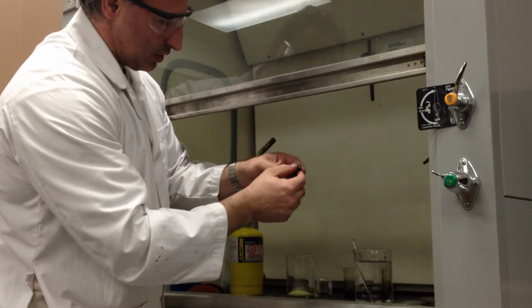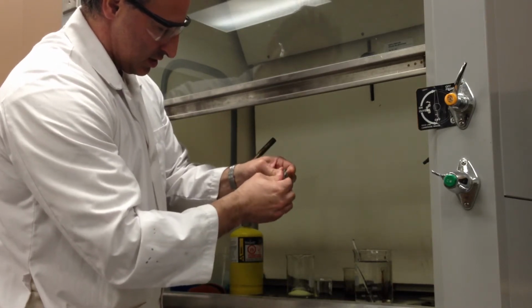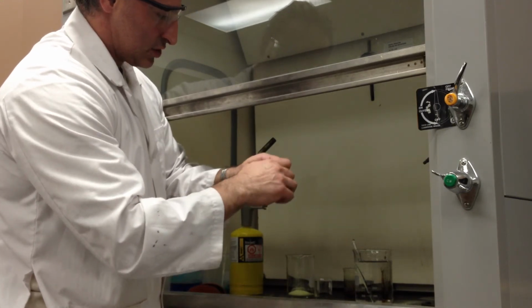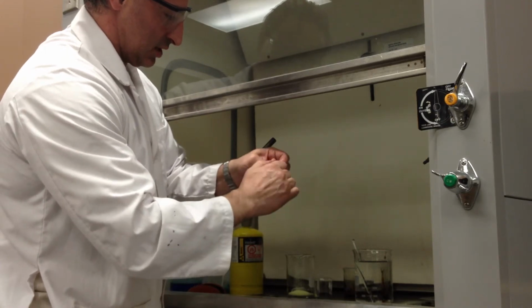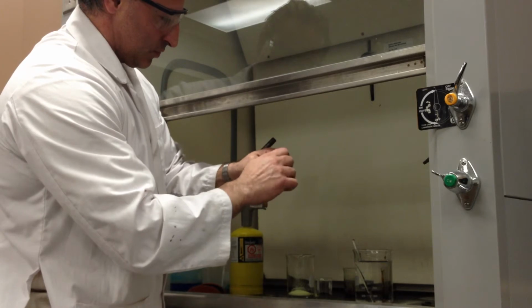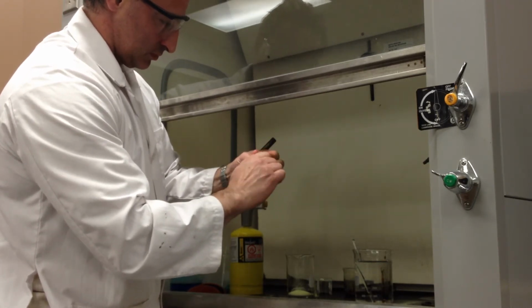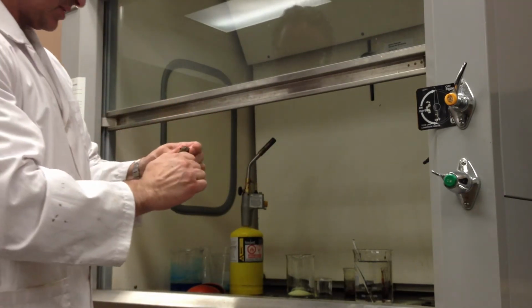And then within several hours it'll return to its harder state. Sometimes minutes. But the reaction can be catalyzed. I don't know what you would have to add to make it harden faster, but by playing around with it, it also returns to its normal state. So it's cool to the touch, but it still has plastic properties.